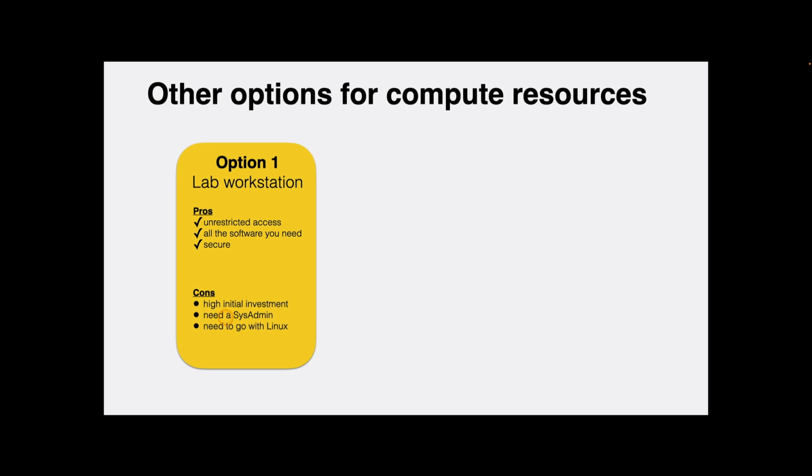Somebody also needs to serve as the systems administrator for this machine. In other words, they need to be able to maintain and keep the machine working well for everybody in the group. If somebody needs new software installed or updated, the sysadmin would be the one to do that. And then, although I don't view this as a con, some people might, high-end lab workstations often are Linux operating systems. I love Linux operating systems, but if you're not familiar with them, it can be just another technological hurdle or obstacle for you and your group to overcome.